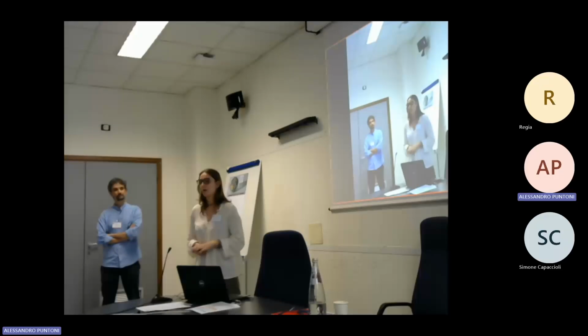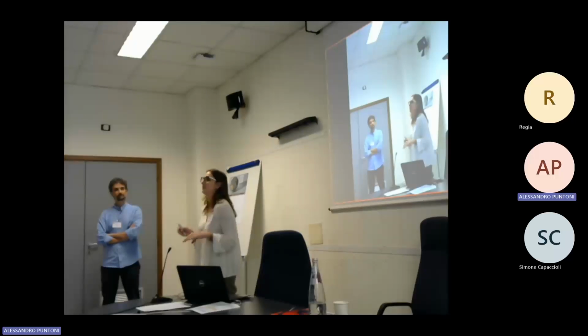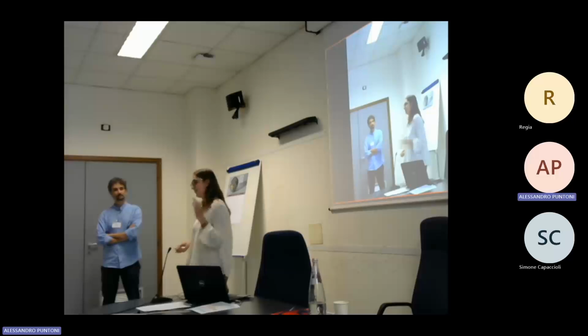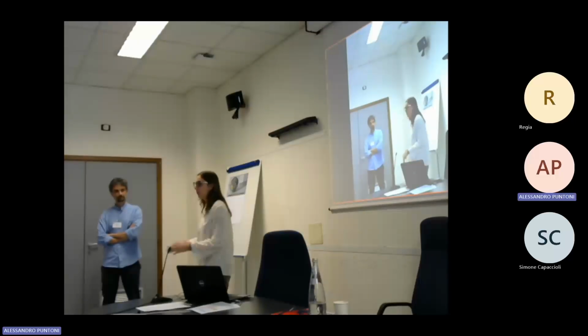This works on the illumination of the sample. So there are methods that engineer how I can illuminate my sample, or there are other methods that don't use light but use electrons. But with the chromatin, there are more problems. So for the chromatin, also in the literature, I think that single molecule localization microscopy is the best, but for sure there are other types of techniques that could be useful and also be integrated in the same measurement.